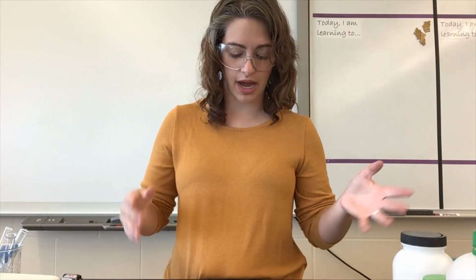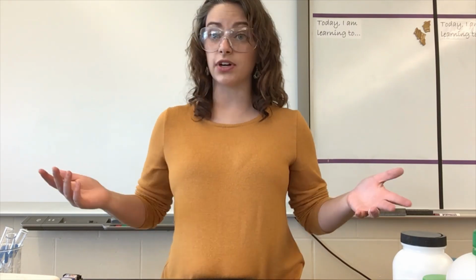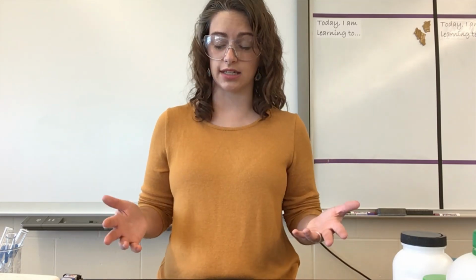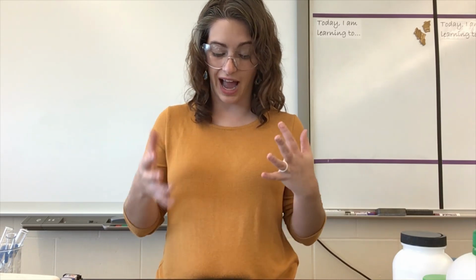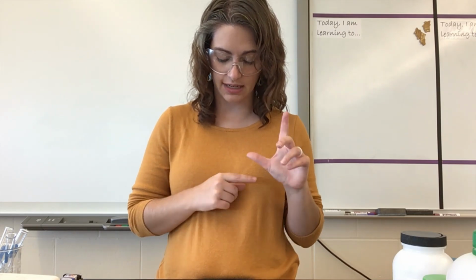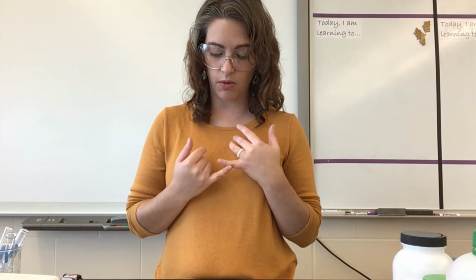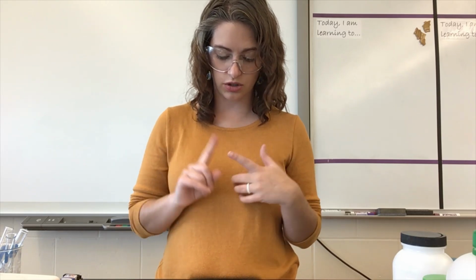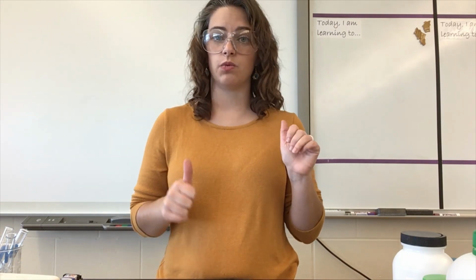Okay, so let's go back through. You have your appearances for all of the different solids. Solubility, everything was soluble in water except for the naphthalene. Nothing conducted as a solid. In solution, calcium chloride did, urea kind of did, sucrose did not, sodium bicarb did, potassium iodide did, and naphthalene did not because we couldn't test it as a solution. For melting points, calcium chloride is high, urea was low, sucrose was low, sodium bicarb was high, potassium iodide was high, and naphthalene was low.